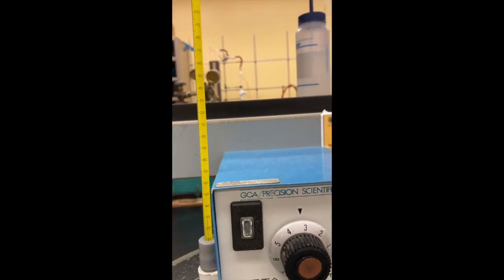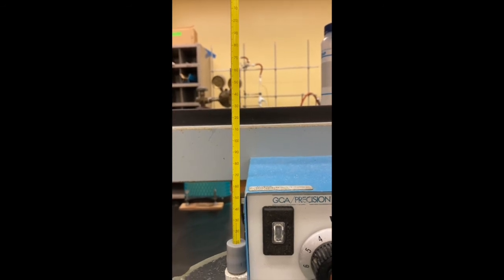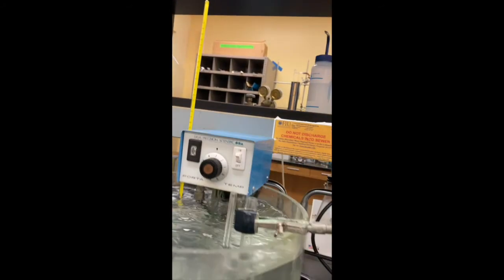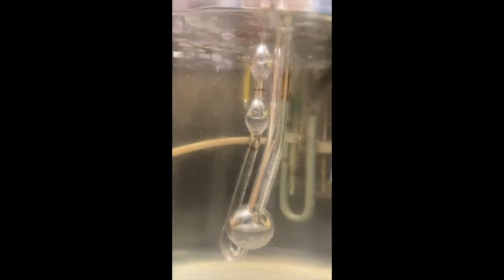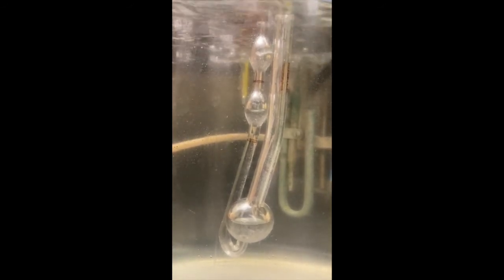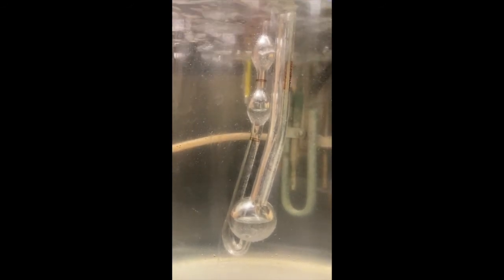It's critical that all the measurements of pure water and solutions with different concentrations of cleaved and uncleaved polymer are taken at the constant temperature. You can see now the liquid is about halfway between the upper mark and the lower mark. About 2 minutes and 15 seconds have passed since we started.